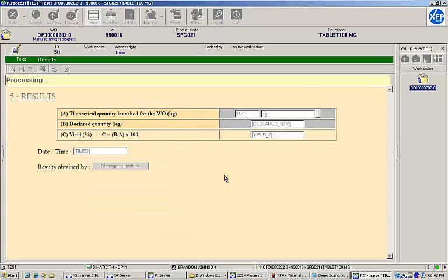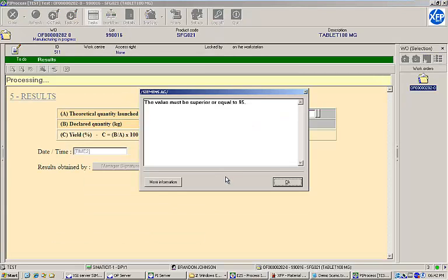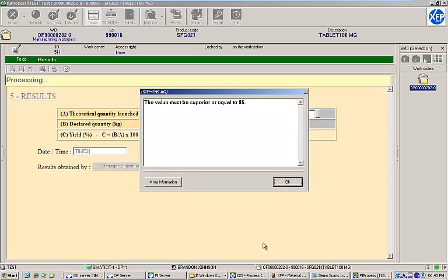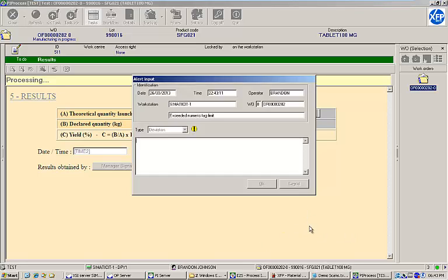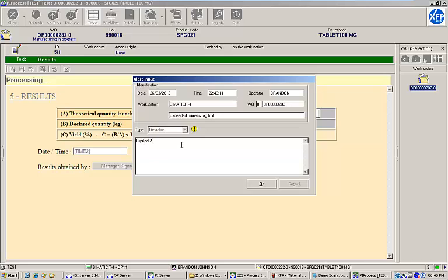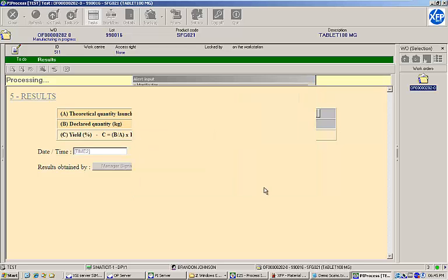The results task shows a summary of our batch output. As you can see, the theoretical quantity to produce was 15 kilograms. We lost two kilograms along the way and only produced 13. This means our yield was only 86.67%. Since the yield was expected to be greater than or equal to 95%, an error message was produced. An alert has been generated and we are asked to input a comment to explain why our yield is not within range. This comment will need to be reviewed before the batch can be released. I'll input a comment explaining that I spilled two kilograms of material and move on.